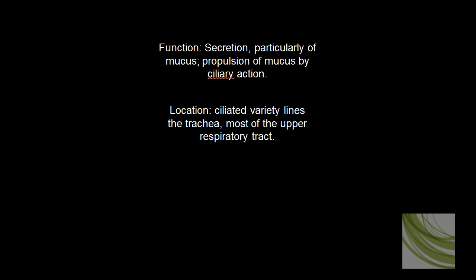This is pseudostratified ciliated columnar epithelium, PCCE for abbreviation. The function of pseudostratified ciliated columnar epithelium is primarily the secretion of mucus and the movement or propulsion of that mucus by ciliary action, and we find it primarily in the trachea and upper respiratory tract.